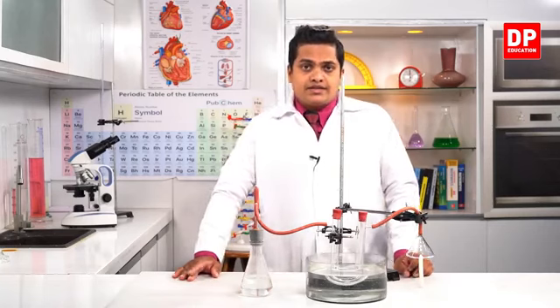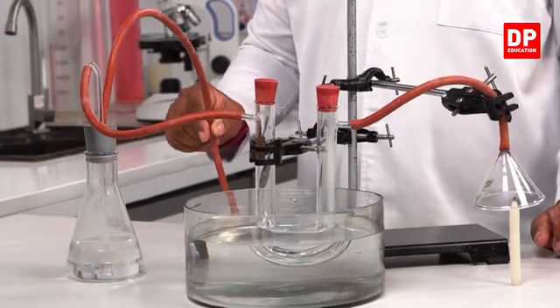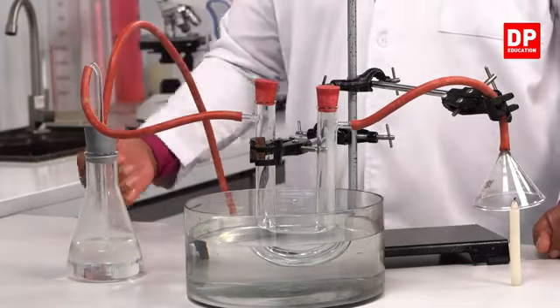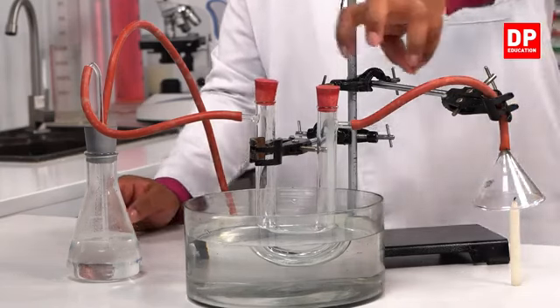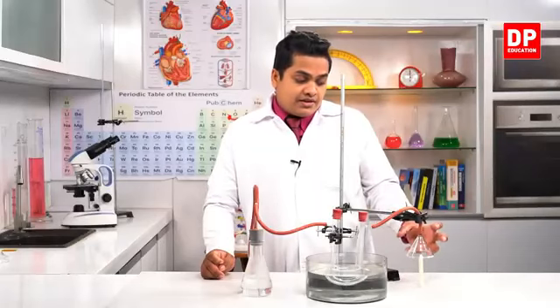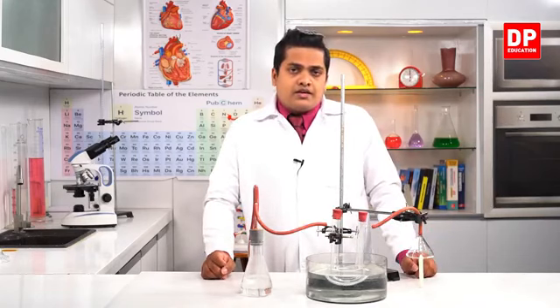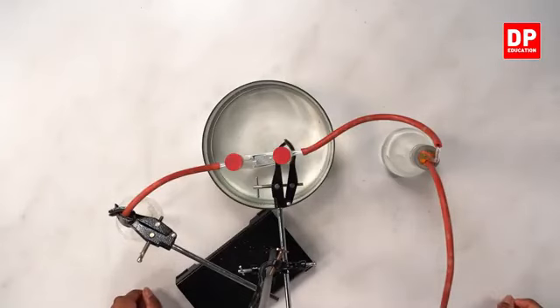But there is a certain thing: we have to connect this to an aspirator like this. We have to suck the air out of this system so that the smoke will come directly towards the delivery tube, towards the U tube. Otherwise, if the flame of the candle is going here and there, we can't get a direct observation clearly. So therefore, I have connected this system to an aspirator, right?